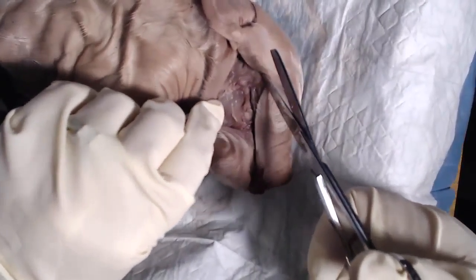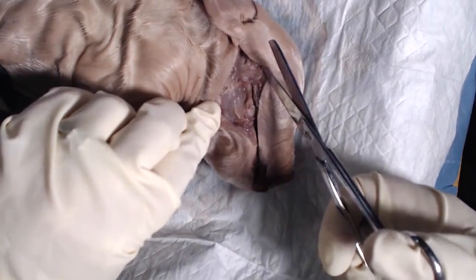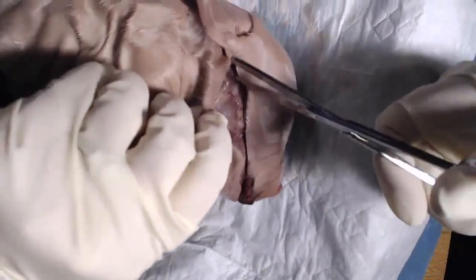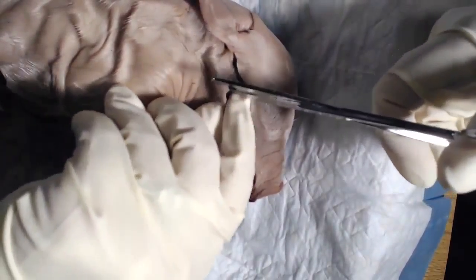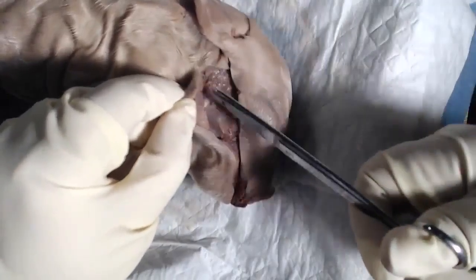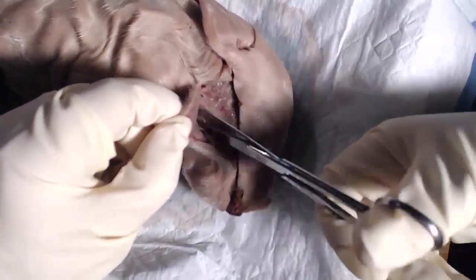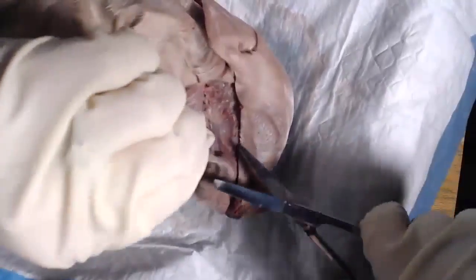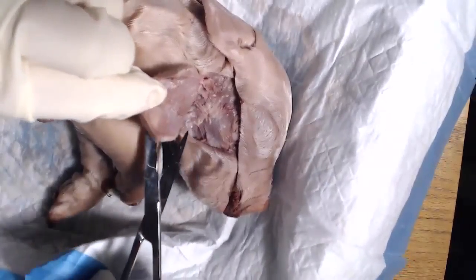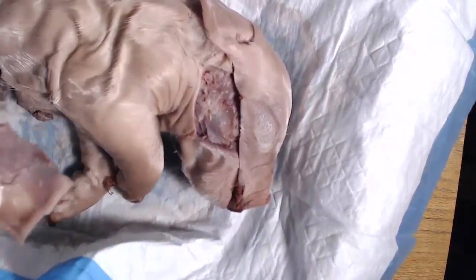All right, now we're starting to see some structures as I pull away the skin. This is what you should be seeing on your own pig. You can cut the skin away on either side to make flaps, or you can completely remove it if that's easier. I think I'll do that with my pig, just totally remove this skin flap here.